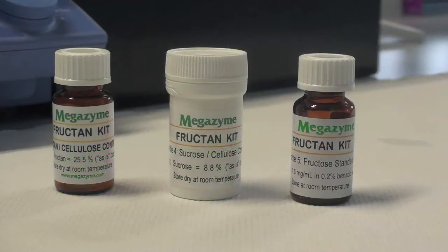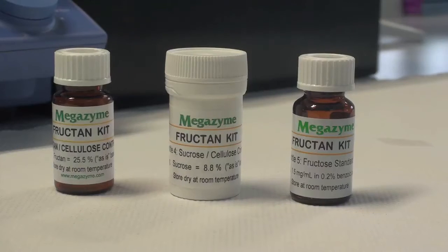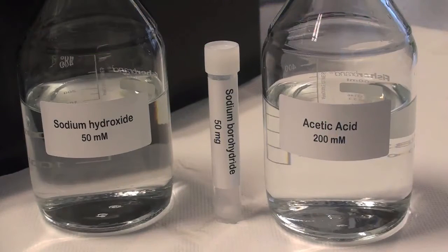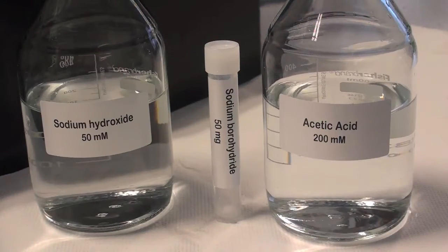Use the contents of bottle 3 fructan control flour, bottle 4 sucrose control flour, and bottle 5 fructan standard solution as supplied. Prepare sodium maleate buffer and sodium acetate buffer as described in the booklet. The sodium hydroxide and acetic acid solutions are prepared according to the instructions in the booklet.